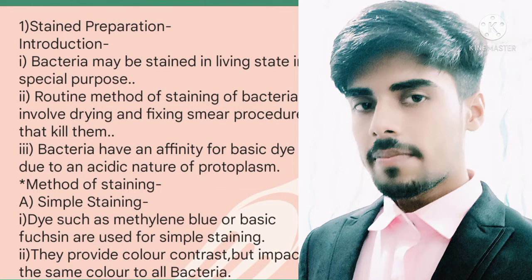Now we will discuss the different methods of staining. First is simple staining. In this method, dyes such as methylene blue or basic fuchsin are used. They provide color contrast but impart the same color to all bacteria. This is the disadvantage of simple staining — by this process we cannot identify different types of bacteria.